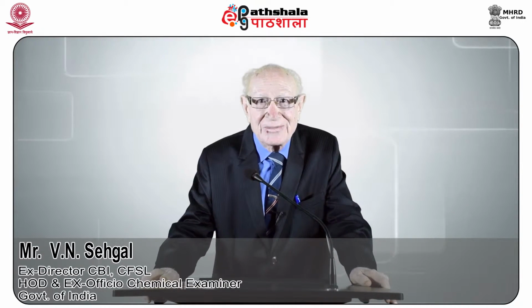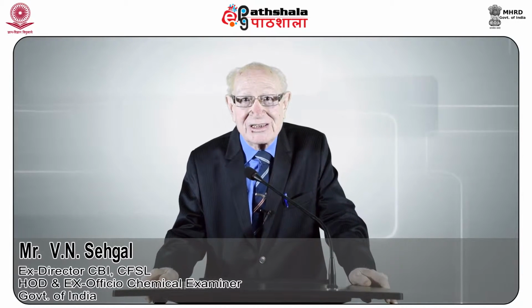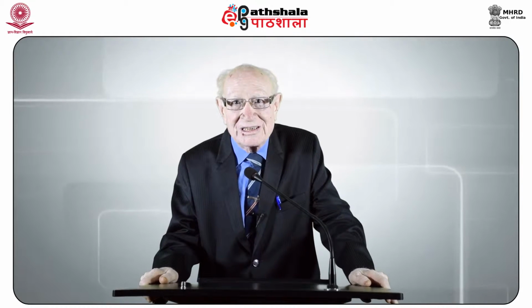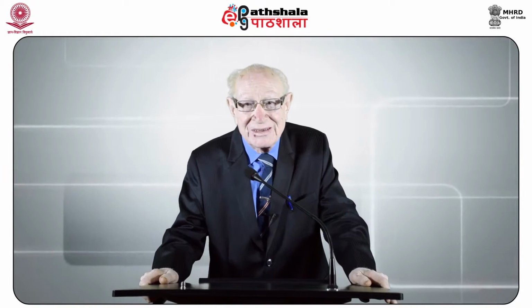Today we shall discuss SEM-EDX, which stands for Scanning Electron Microscope Energy Dispersive System.